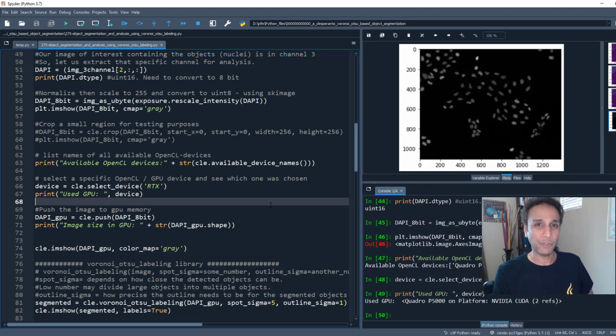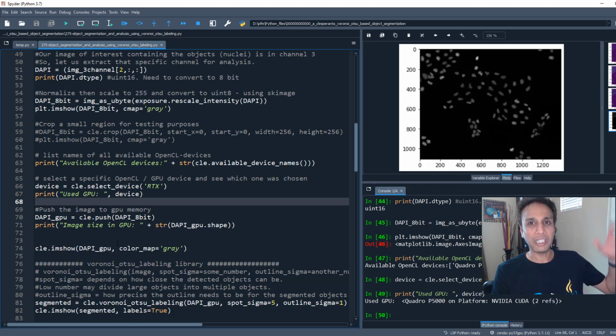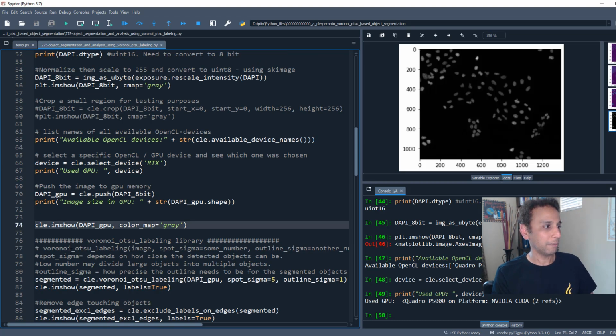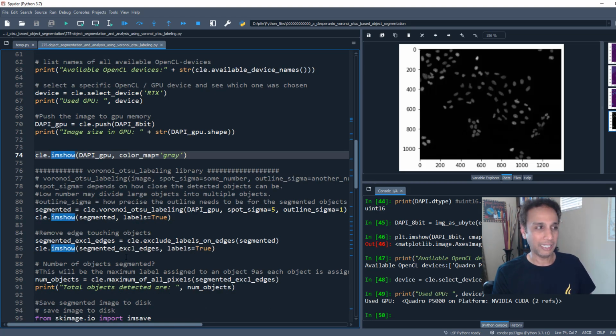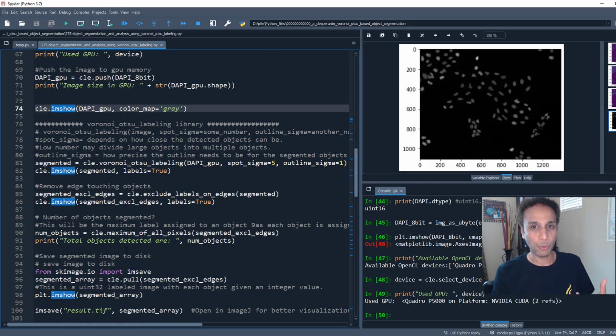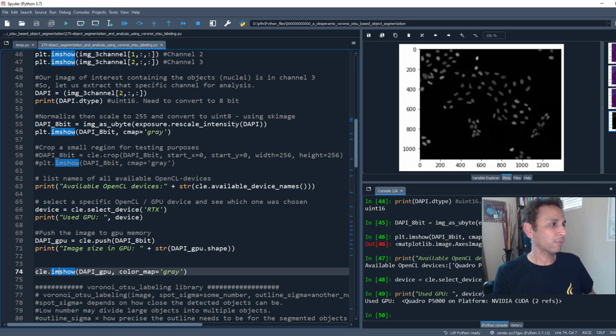Again, if you do not have a GPU, or if you're not working with these multi-channel type images and you just have single images, everything I just showed you is useless. Start with imread and then directly jump on to this part. In fact, the actual meat of the entire code is just one line, like I promised in the last video. I'll get to that in a second. So let's move through this pretty fast.